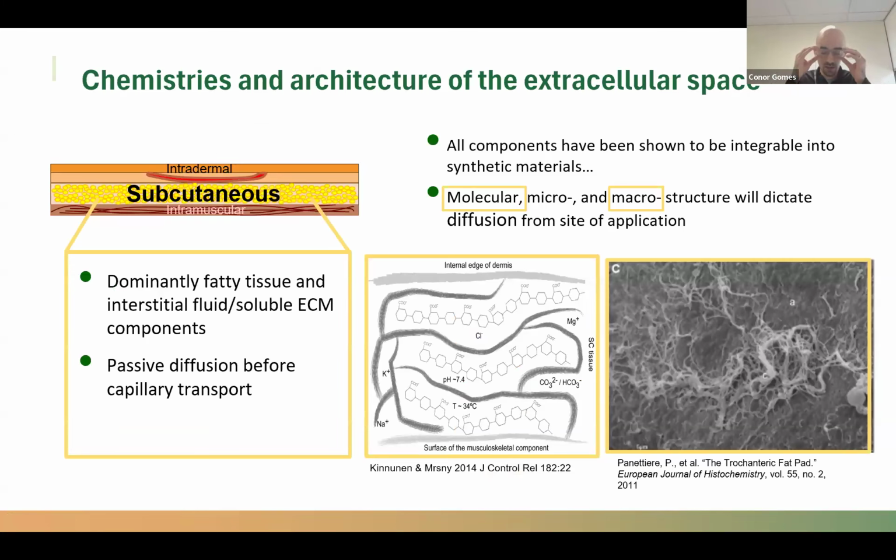However, when we try to extrapolate and hypothesize how our drugs of interest will interact in these spaces, there's a few in silico methods and other methods we can discuss later if anyone has questions. But there are these molecular, micro, and macro structures that will always be apparent that aren't going to really be captured by your traditional dissolution methods or your stirring beaker dissolution methods that we're doing on a benchtop.